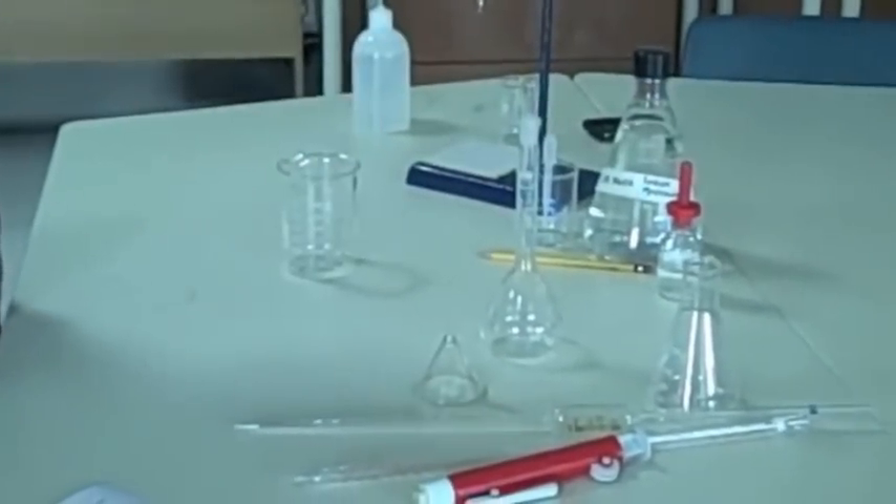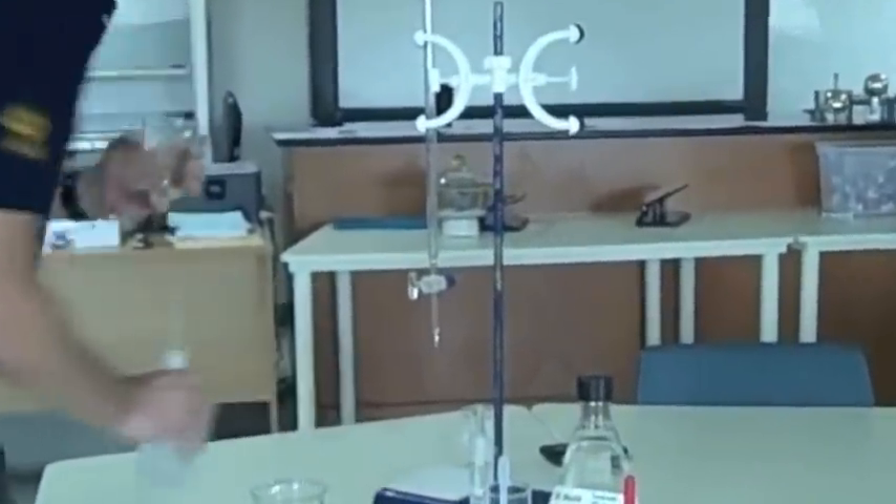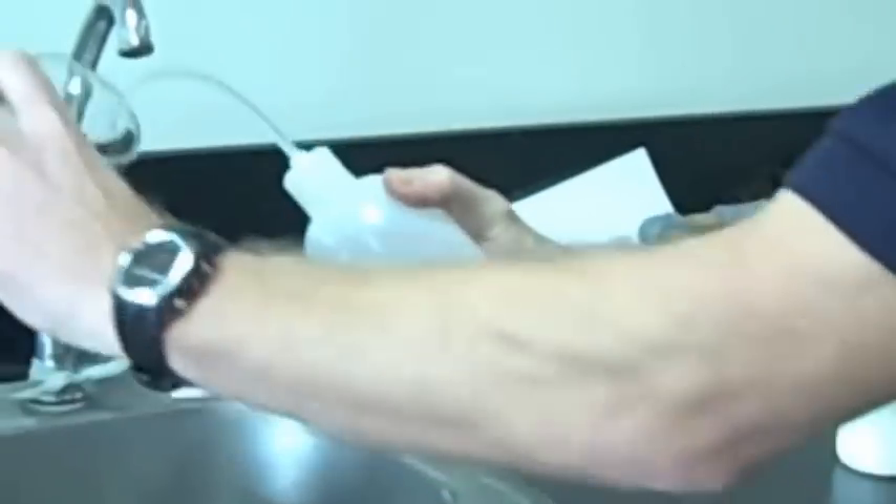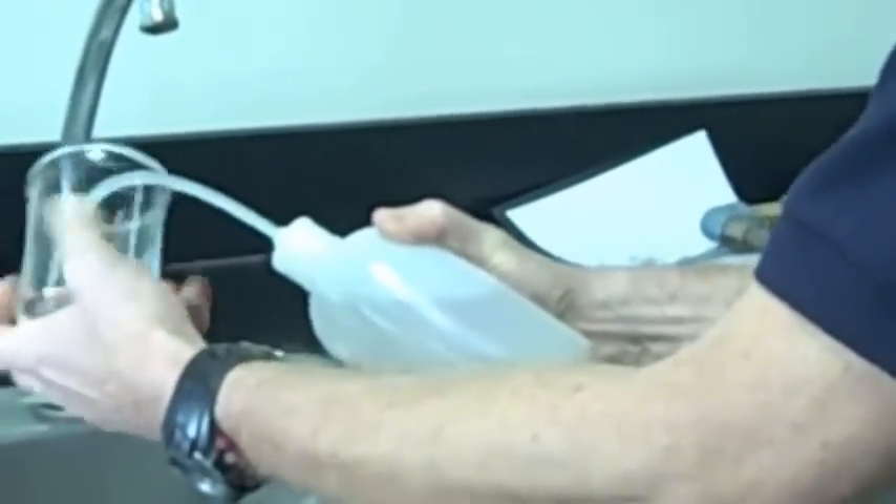I'm going to dissolve it in a clean beaker. Now that beaker needs to have been washed with some tap water and then finally rinsed with some distilled water. And here's how I rinse with distilled water — just turn it, making sure that all the surfaces are coated. It doesn't need to be dry because most of my solution is going to be distilled water. So the first thing I do is tip that in here.